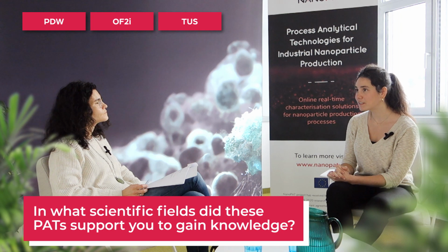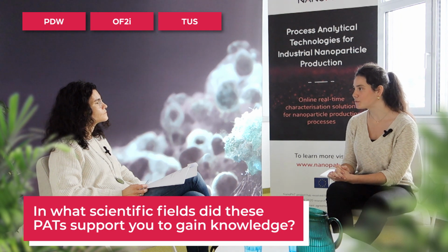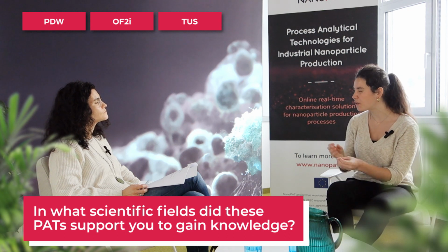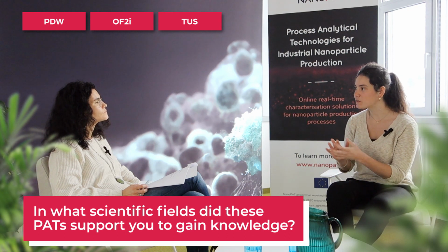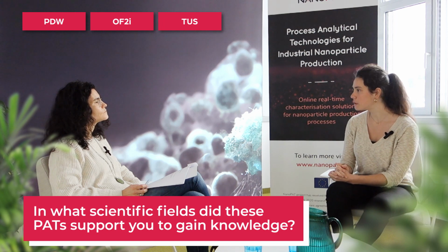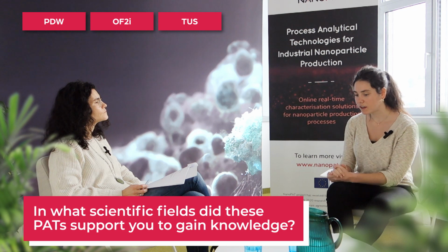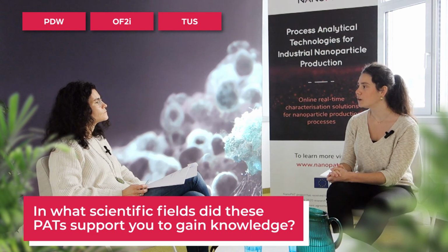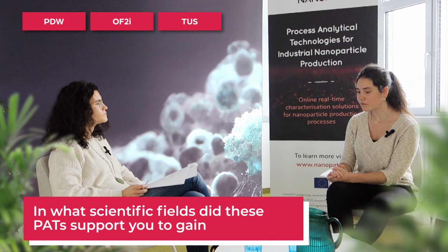And even if the detection of the new nucleations was really challenging, and we still have to go a bit more into detail to see if we are able to see something on it, we have to say that, for example with the PDW, we can completely observe the aggregations. So this is really important, so that then we are able to create some control systems and detect if everything is going as expected or we are having these phenomena. Mm-hmm.